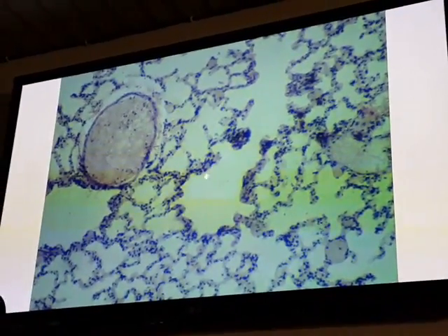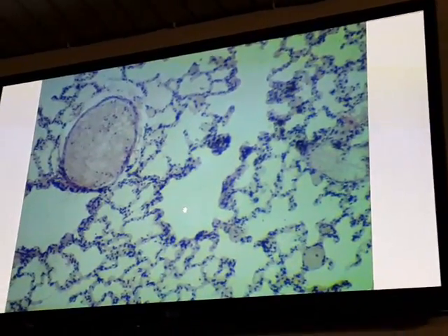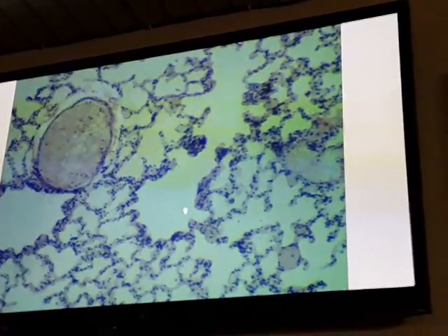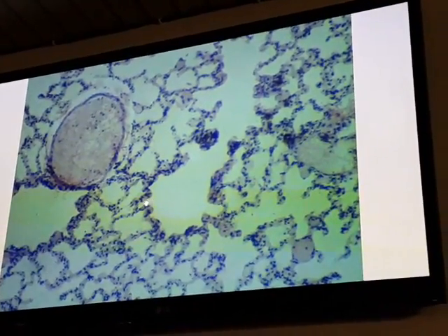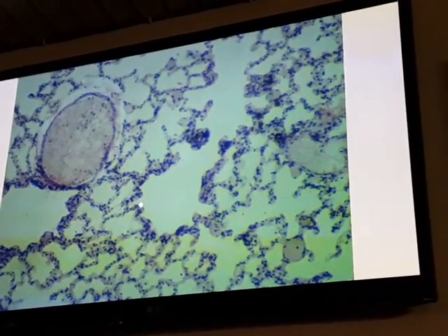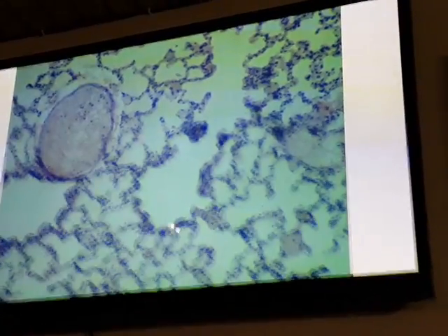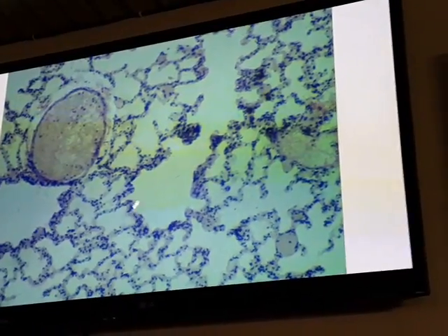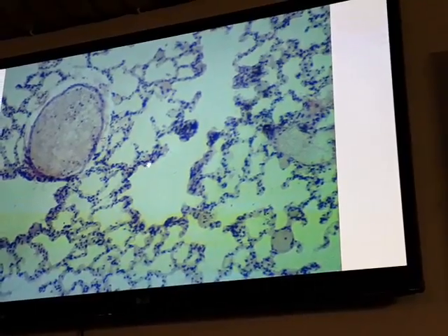Respiratory bronchiole. Each terminal bronchiole divides, giving rise to 2 or 3 respiratory bronchioles. How do we distinguish respiratory bronchioles? The wall is interrupted by openings of alveoli. You see the wall contains openings of alveoli. This is the respiratory wall, respiratory bronchiole.